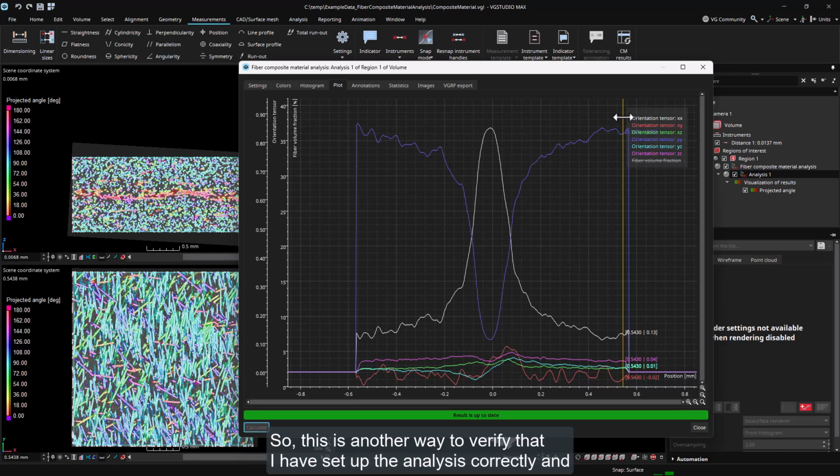So, this is another way to verify that I have set up the analysis correctly, and that my analysis results are plausible. It may seem a little bit complicated at first sight, but what I would recommend is that you just give it a try.